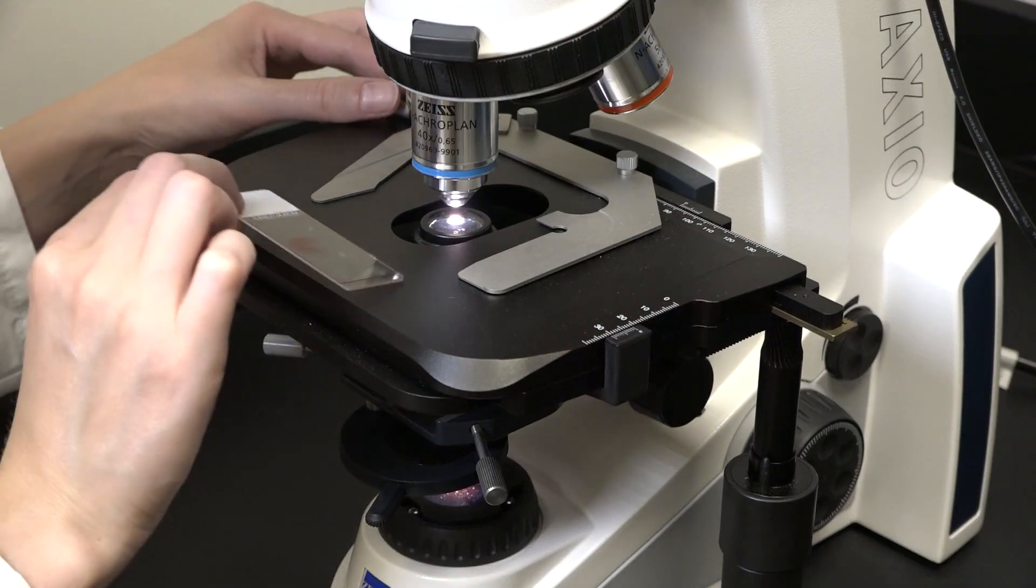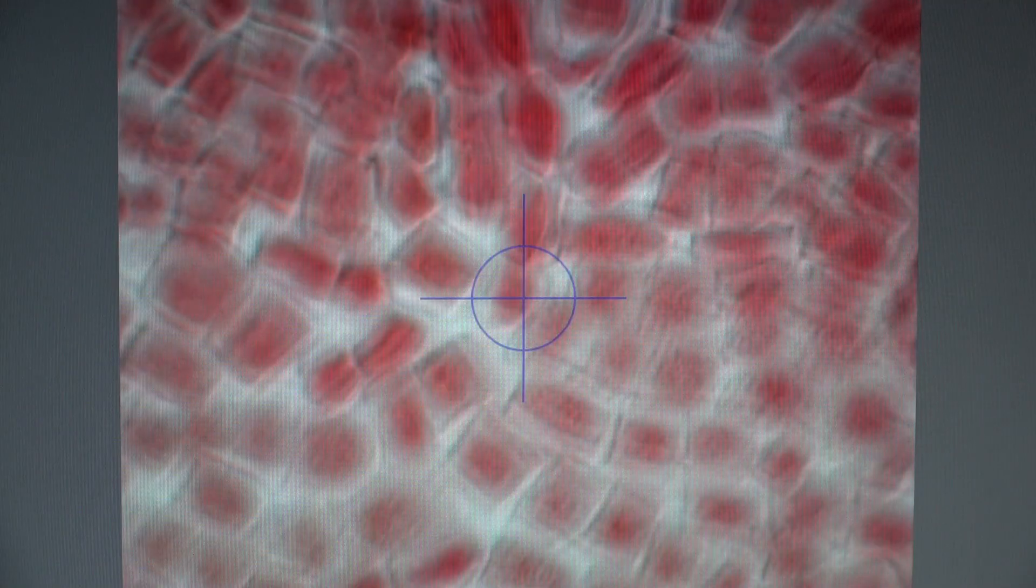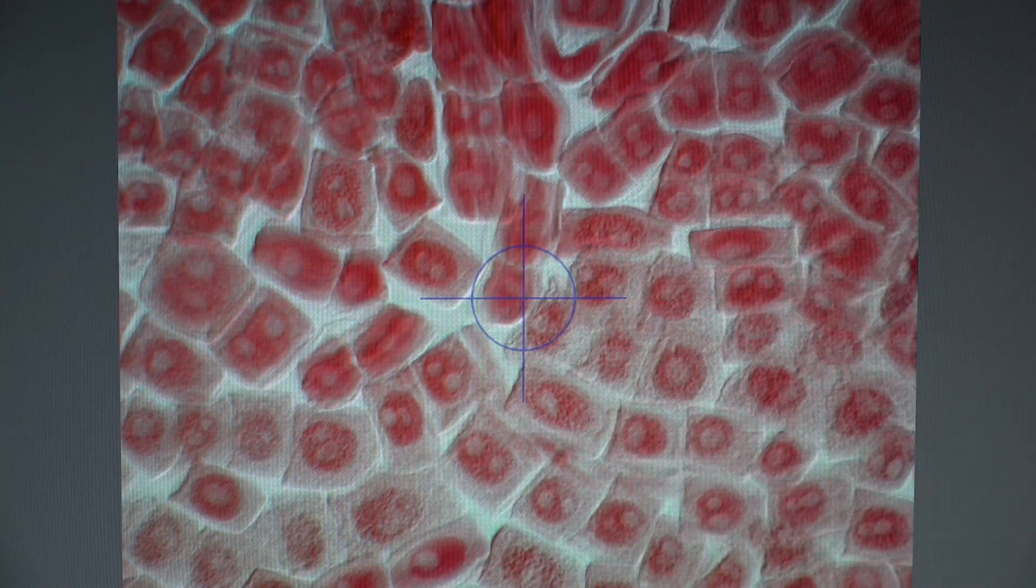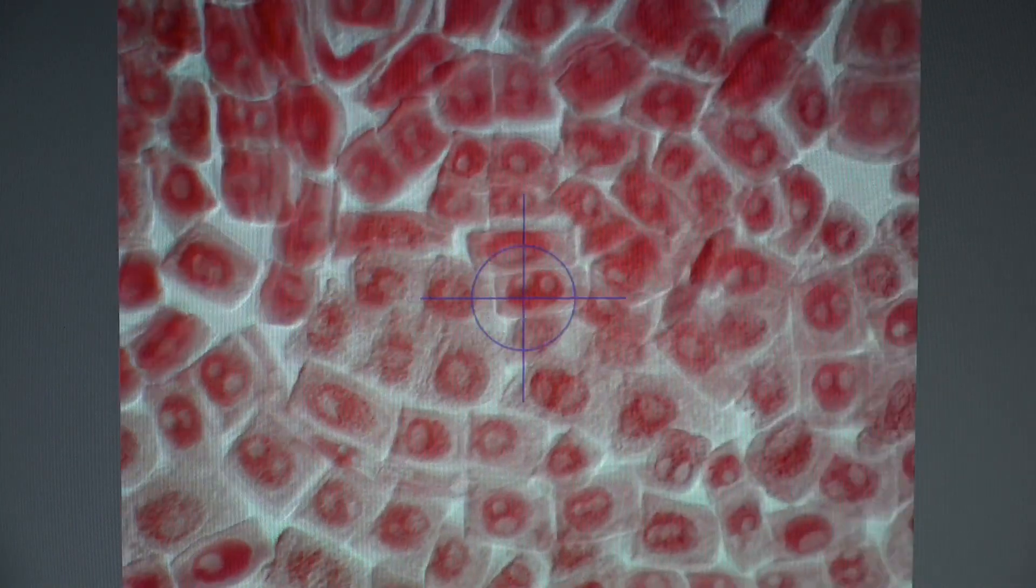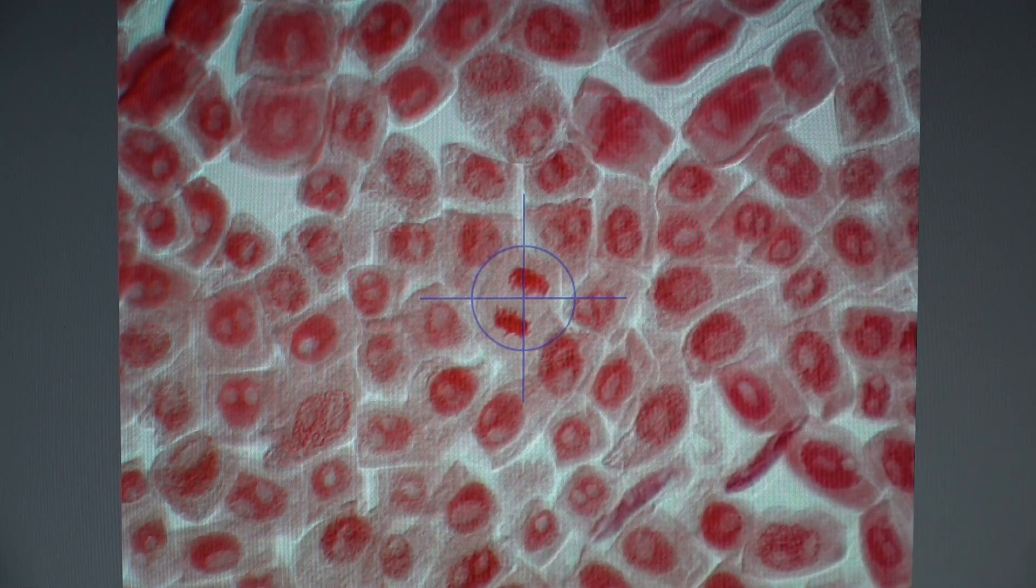And finally, the moment of truth. Let's put the slide on the microscope and see what we can see. Okay, here are a bunch of squashed cells. Great! Let's look around. Ah, that's definitely some mitosis going on.